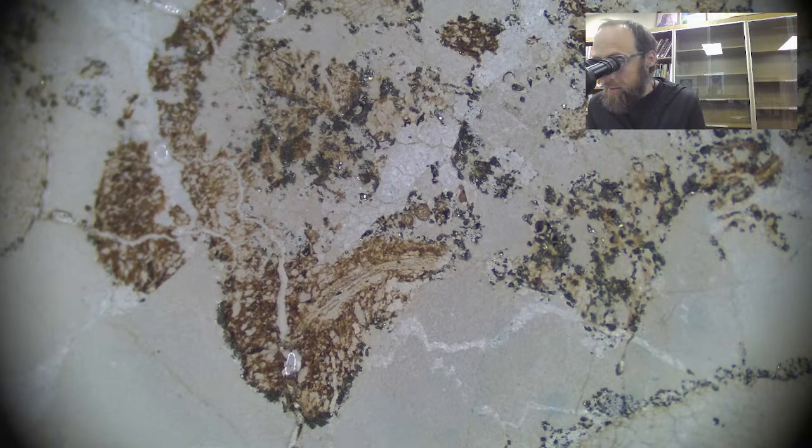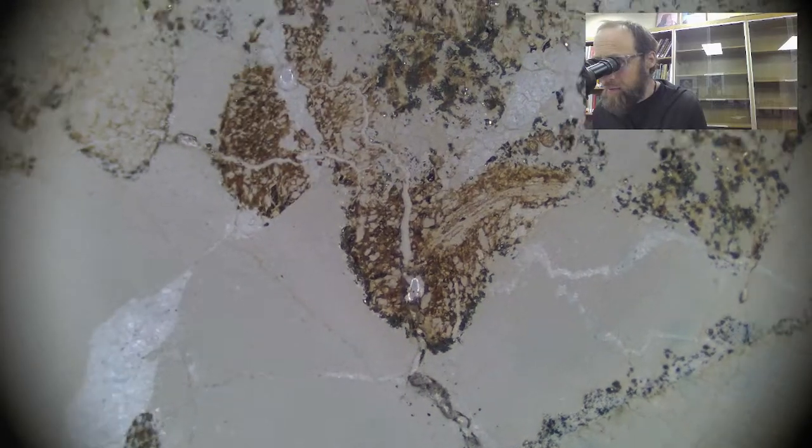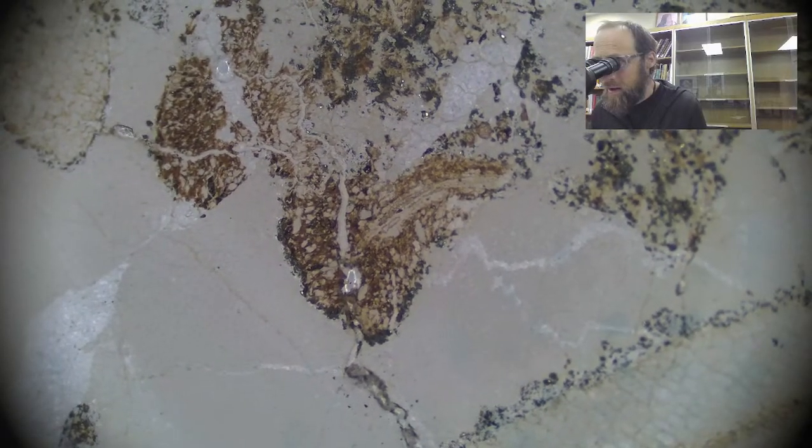That's just what it looks like, but I'm not going to say that's what it is, and I don't think that is what it is. It's probably a developing tissue. Maybe it will develop into a spore-bearing structure, or maybe it's a fully fledged spore or pollen, hard telling. And also hard telling what is that piece of tissue right underneath.